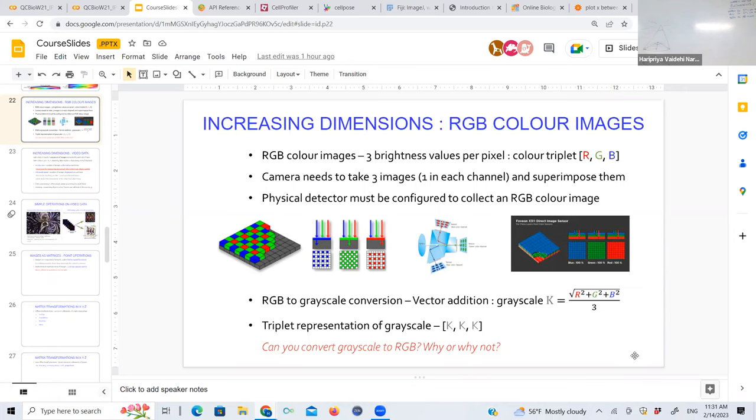So every pixel is actually a cluster of 4 pixels. And over 2 of them on the diagonals, they put a red filter and a blue filter, like you see right here, the blue filter and the red filter. And the other 2 along the diagonal are green filters. The reason for this blue to green to red ratio of 1:2:1 is that our eyes are twice as sensitive to green than to blue or red. So by collecting green in 2 pixels and blue and red in only 1 pixel each and adding that, you're kind of mimicking what the eye sees, because the human eye is not equally sensitive in all these wavelengths.